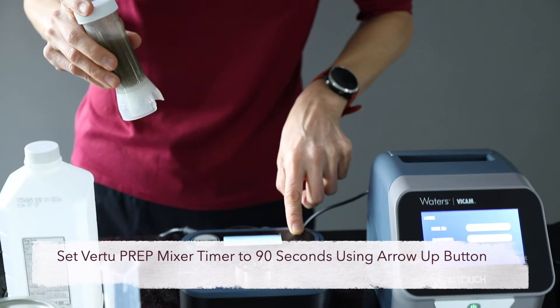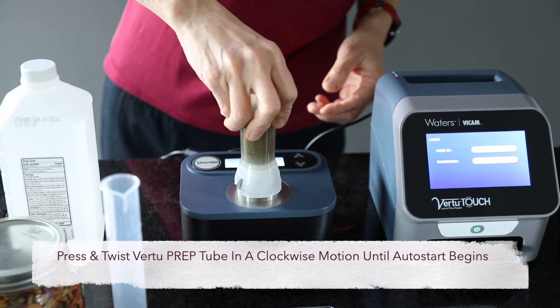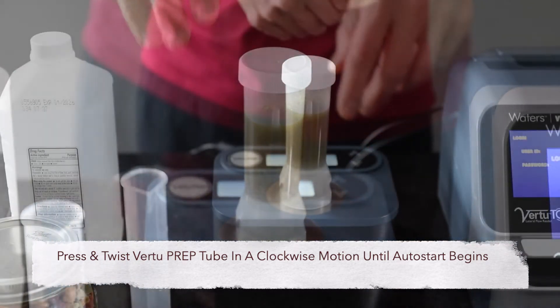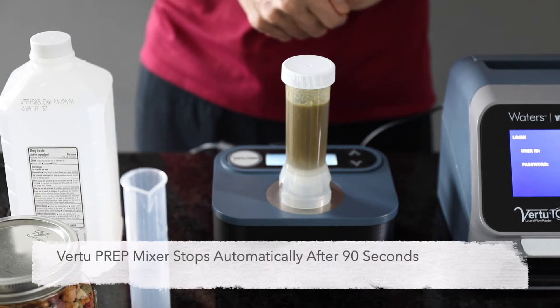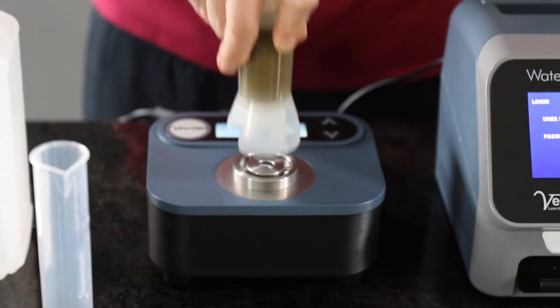Set the onboard timer to 90 seconds. Press the Virtu Prep extraction tube onto the mixer base and twist in a clockwise direction until the locking mechanism engages. Once the tube is in place, mixing begins automatically. The Auto Shutoff feature enables walk-away automation.